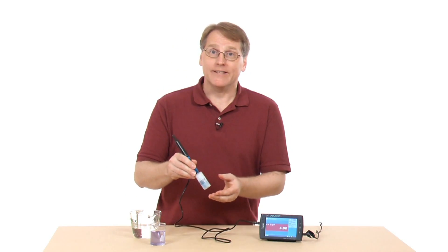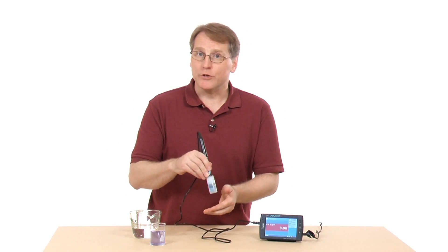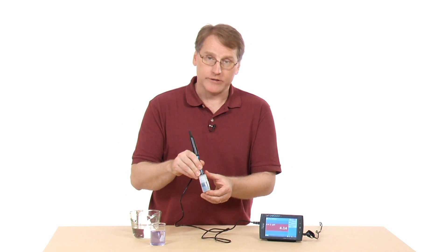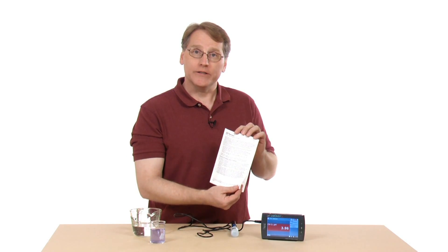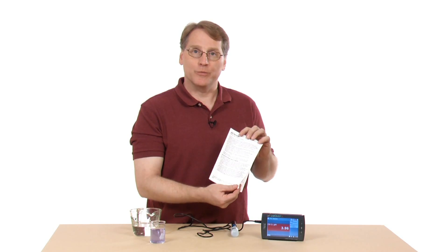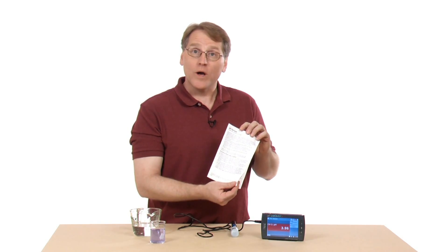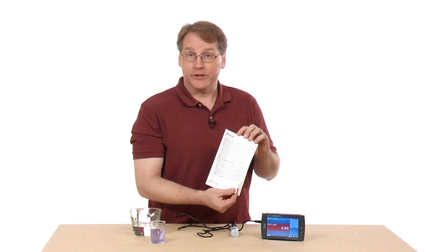So again, it's a very useful sensor. It's used across the curriculum, so it's definitely one you should have. All of our sensors come with a booklet - this is the pH sensor booklet - and a lot of the common questions people will have about this particular sensor would be answered in here.